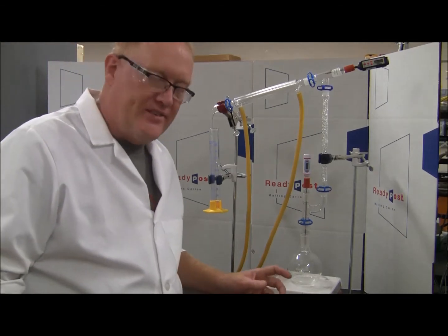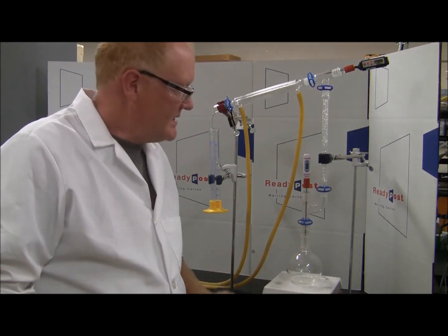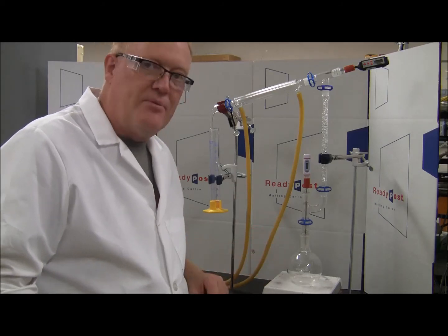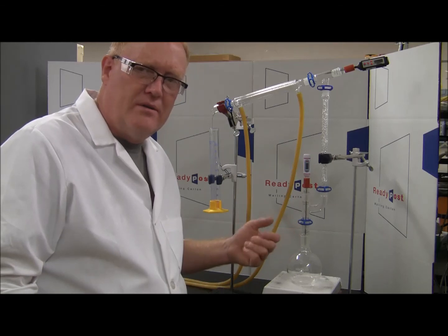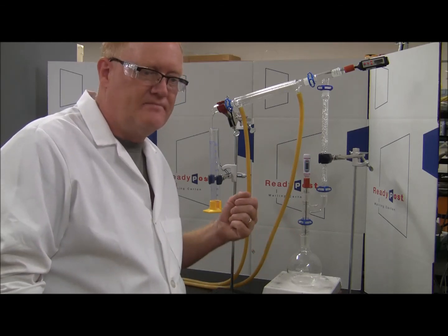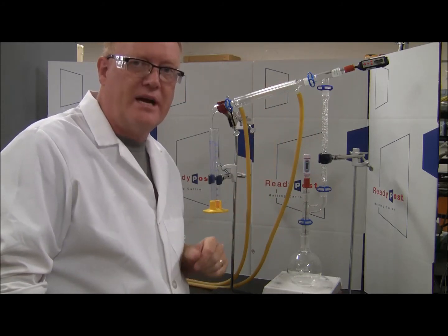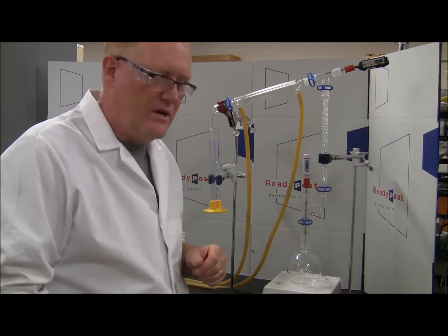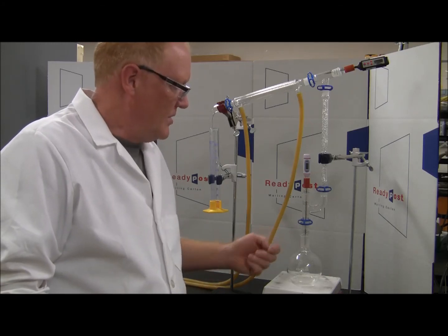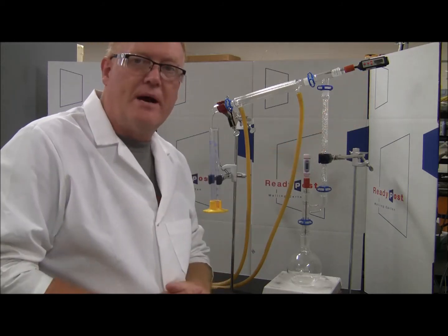Okay, for the experiment itself, we're going to put the glucose solution in the flask. Go ahead and turn your hot plate on. Be very careful as you're bringing it up to a boil. Once it gets to a boil, if it boils too hard and too fast, you'll actually be pushing some water up to the reflux column through the jacketed column, and you get a really dilute ethanol output. Okay. We're going to monitor the top thermometer.